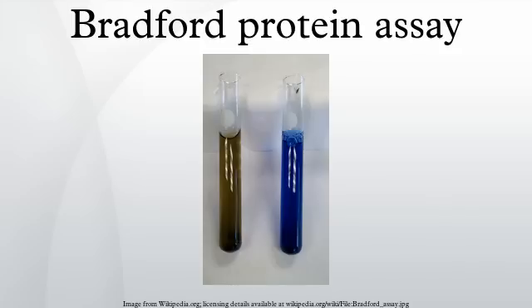This causes an increase in the absorbance at 595 nm independent of protein presence. Other interference may come from the buffer used when preparing the protein sample. A high concentration of buffer will cause an overestimated protein concentration due to depletion of free protons from the solution by the conjugate base from the buffer. This will not be a problem if a low concentration of buffer is used.